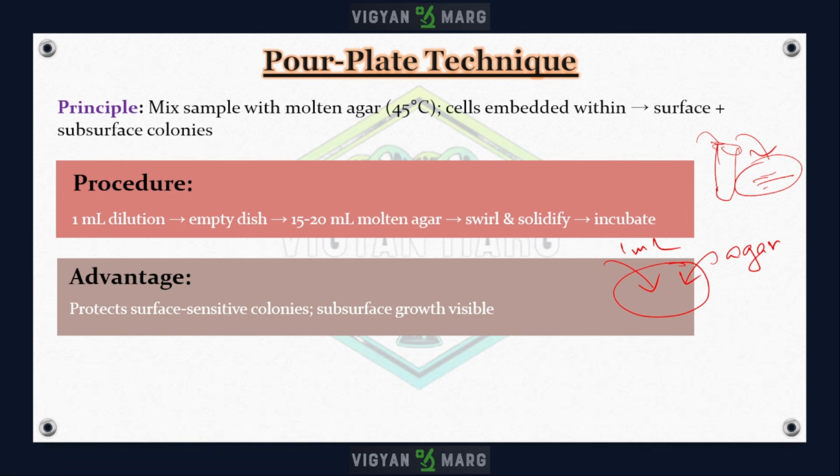As the bacteria grow, colonies develop both on the surface and within the depth of the agar. The surface colonies appear larger, while the embedded colonies appear smaller and lens shaped. Okay, the advantages include being better for some organisms that spread excessively on the surface, such as swarming Proteus, because being in the agar restricts the movement of that bacteria. Okay, that's why you should not spread it on the top. And it can be helpful for heterogeneous samples, and certain specific regulatory methods prefer pour plates. The disadvantages are that some bacteria may be heat sensitive and damaged by the 45-degree agar temperature.